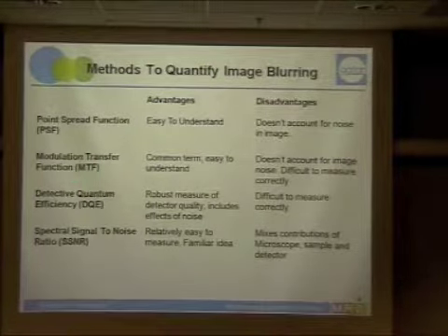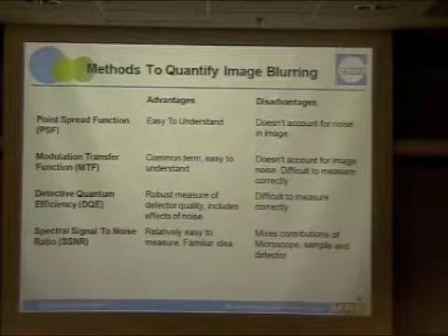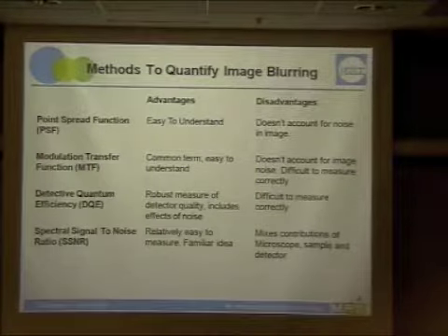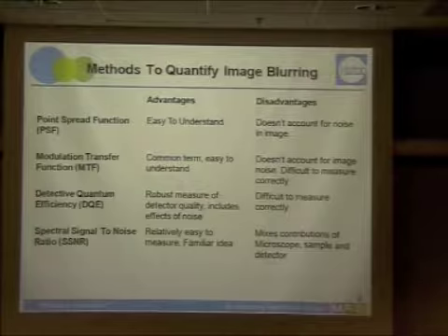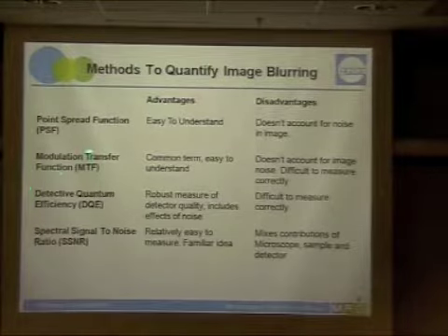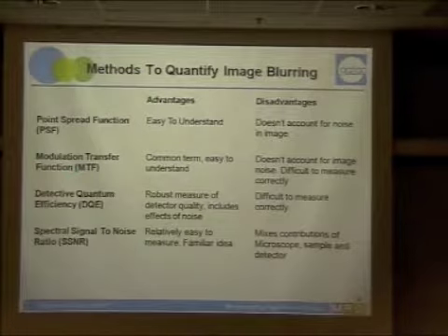And I appreciate the comment earlier: the MTF is not the same thing as the NTF, which is what you get if you take a flat field image and do a Fourier transform of that. It can look a lot better than you're justified in believing. If you had a very noisy detector, the NTF would look really good, and you'd fool yourself into thinking you had higher image quality, when in fact it's poorer. When that gets confused, it's sometimes difficult to compare apples to apples.